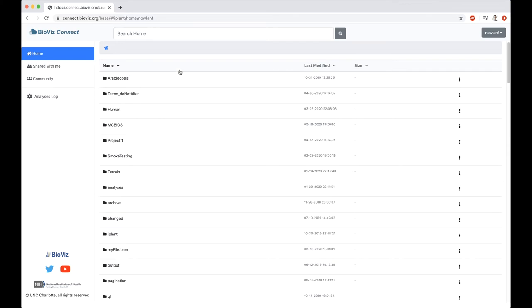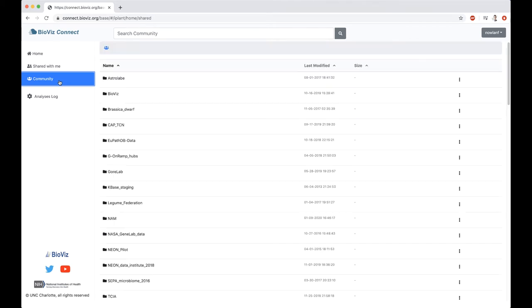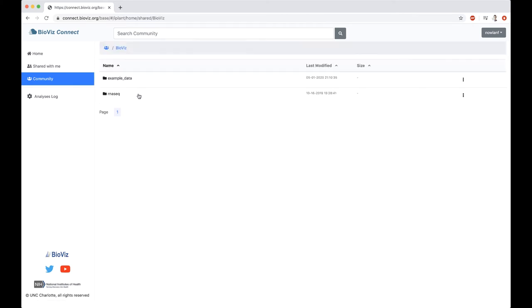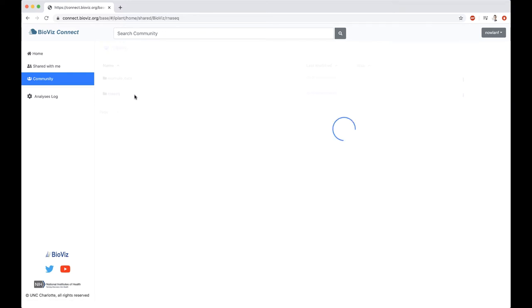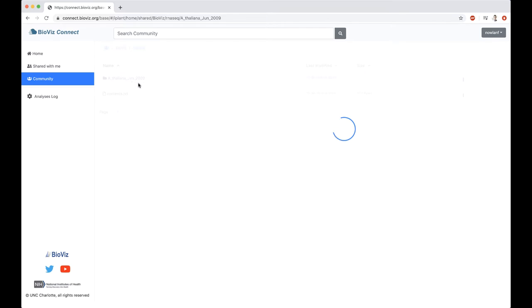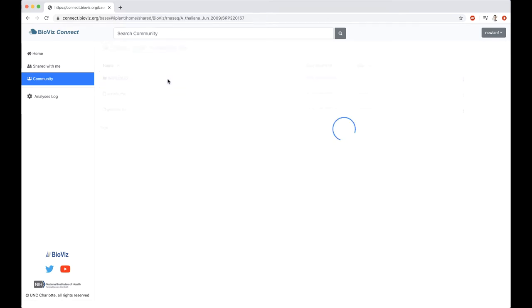The example dataset that we're going to look at today follows along with the BioVizConnect publication. That data is available through community, so anyone who is logged in will have access to it. I'm going to go to community. The data is under the BioViz folder. Note that navigating, I can click and select folders to enter a folder, double click on it. We're going to go into RNA-Seq. Arabidopsis thaliana, June 2009. The project number.